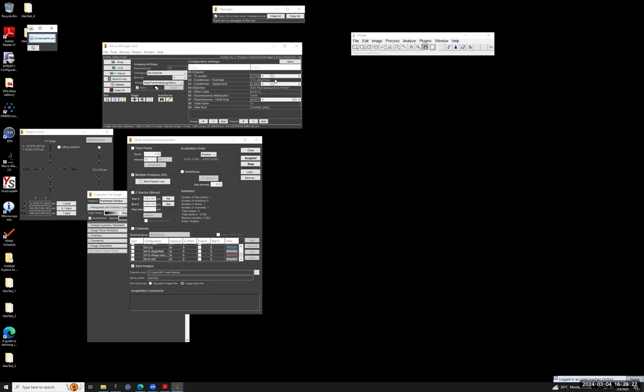So there, it's not a great idea to keep changing the voltage, because when you change the voltage, there's some ramping up. So when I switch to the transmitted light channel, and the fluorescent channel before had a different voltage, there will be some gradual change in the brightness of the lamp while I am acquiring the channel. So that's not ideal and also not good for the halogen bulb. One way, of course, would be that I would go through all the channels and make sure that I set the transmitted light power to the same values for all the fluorescence channels, but that's a bit of a nuisance.